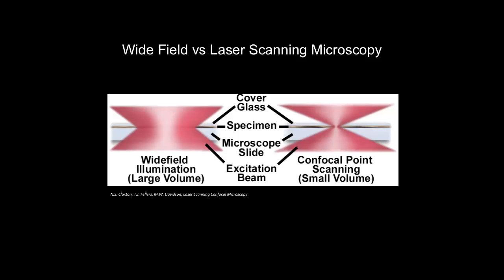So in wide field illumination, in conventional optical microscopy, each plane is evenly illuminated, and the entire field of view is imaged on a CCD camera at once.